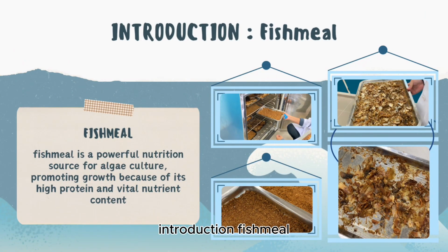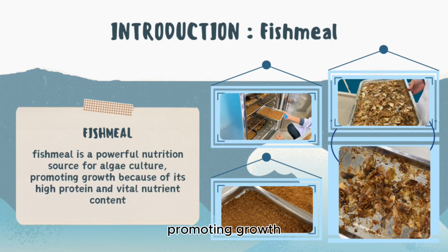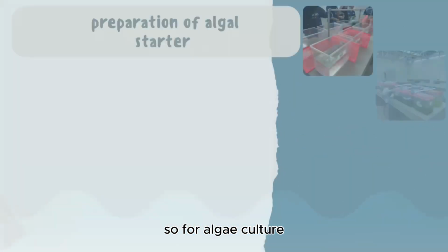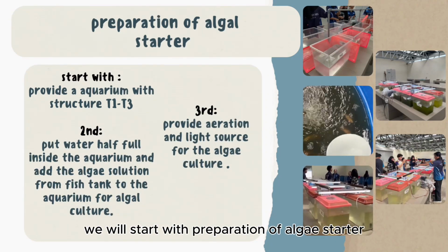Introduction: fish meal. Fish meal is a powerful nutrient source for algae culture, promoting growth because of its high protein and vital nutrient content. In aquaculture, fish meal is often added to the algae tank to promote faster biomass production. So, for algae culture, we will start with preparation of the algae starter.